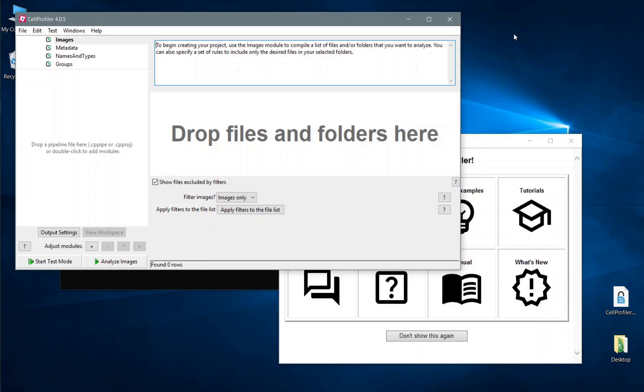Hi everyone, today we're going to be looking at some of the new features which have been added in CellProfiler 4. The interface in general looks relatively similar to CellProfiler 3, but there are a few improvements that we've made in various places which we're going to show off here.